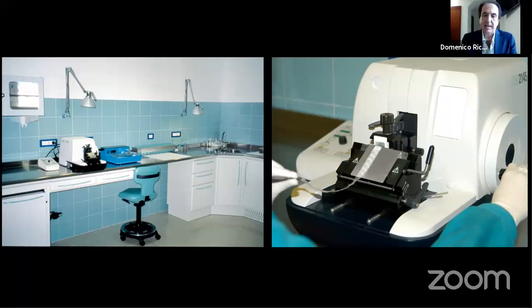Histological slide just to show you what the reactions are at a tissue level and morphological level. So, I am a part-time histologist, because this is the histology lab that I have in my clinic. I have the possibility to process specimens coming from the clinic.